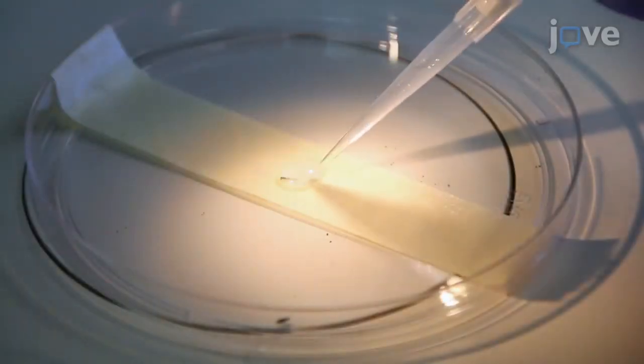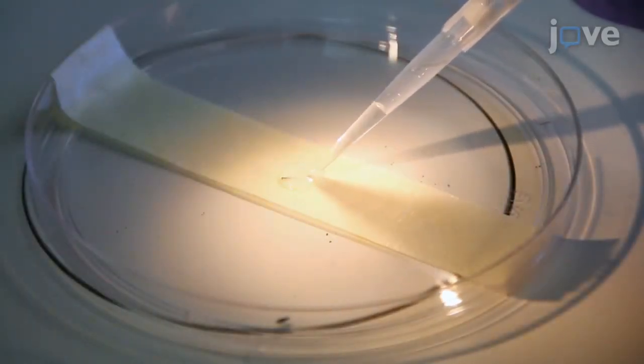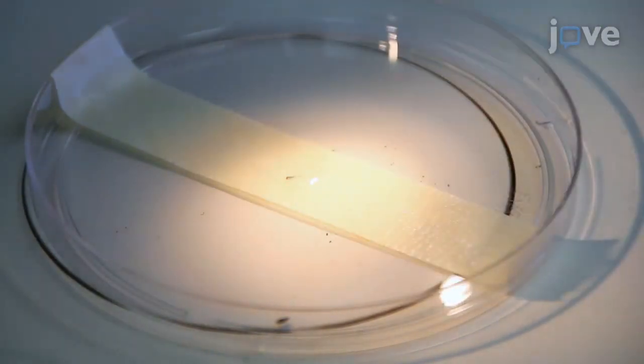Remove excess tricaine solution surrounding the larvae. The area should be as dry as possible to successfully section and pick up the fin, but still wet enough to ensure survival.